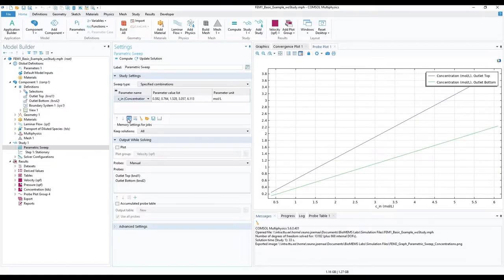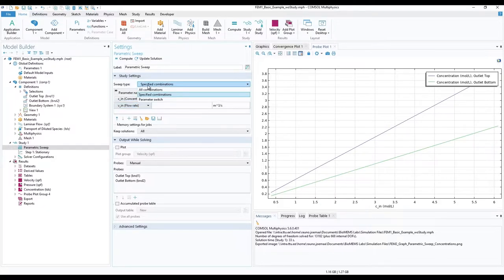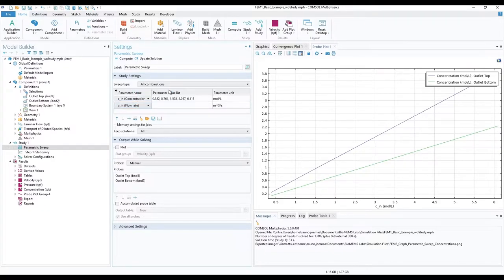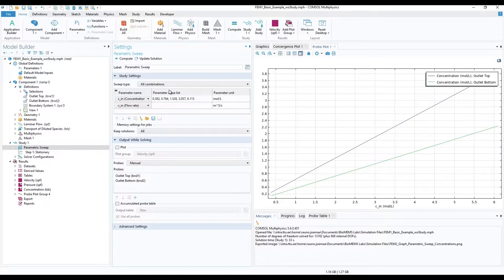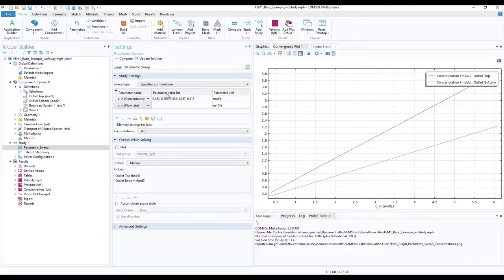But in case we want to keep both, we can add velocity here. And under sweep type select all combinations. This will go through all possible combinations between all variables. For example, 5 options and 4 options for concentration and velocity respectively. We can expect the simulation to run 20 cycles with different parameter combinations.